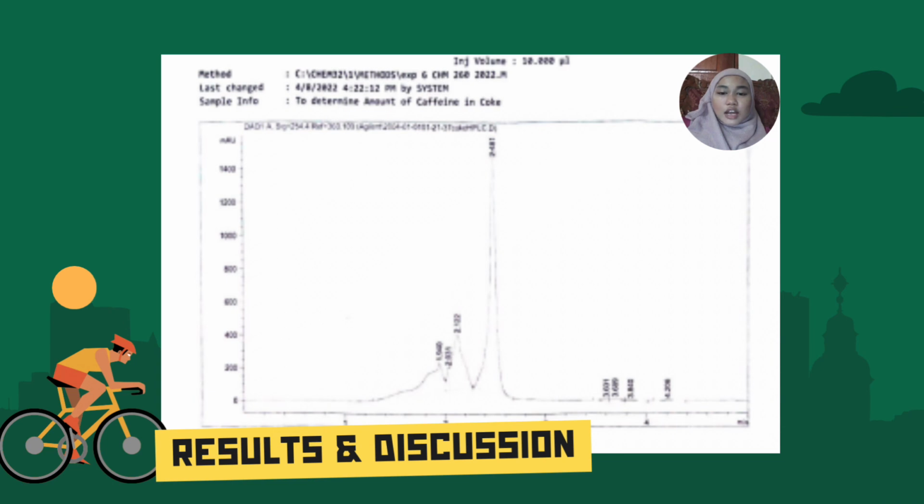When comparing both sets of results, the second results show that peak 4 closely matches the caffeine standard. Both have similar retention times, 2.481 minutes, and comparable peak characteristics such as a high area of 7001.12 and significant height. This suggests that peak 4 in the data likely represents caffeine as it aligns closely with the caffeine standard's retention time and intensity profile. The presence of other peaks in this data indicates that the sample is a mixture with caffeine being the dominant component.